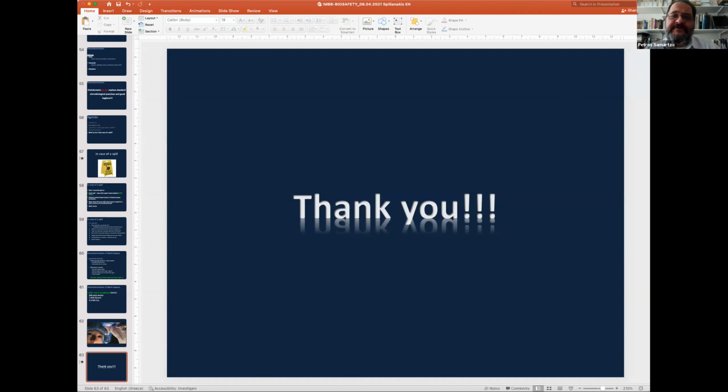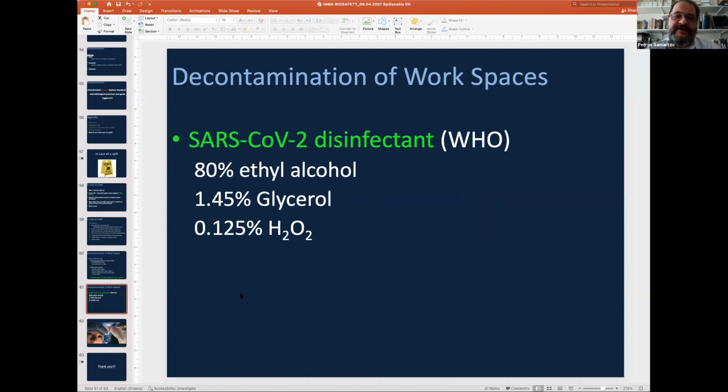The coronavirus, if you do work with coronavirus, what biosafety level do you need? There is only one lab working with coronavirus, and I think that's Dr. Sorvino. I mean, if you do the test, this test that we do, it's okay to do them here. You don't send them outside.